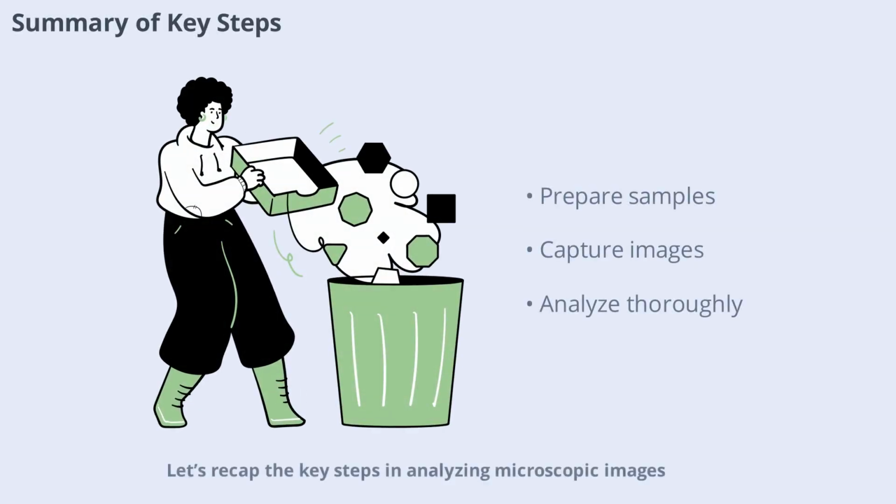Let's recap the key steps in analyzing microscopic images. Prepare your sample carefully, capture high-quality images, use appropriate software for analysis, calibrate and measure accurately, and document your process thoroughly. By following these steps, you'll be well-equipped to draw meaningful conclusions from your microscopic observations.